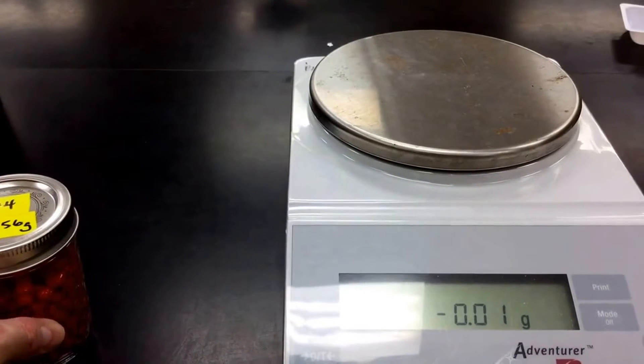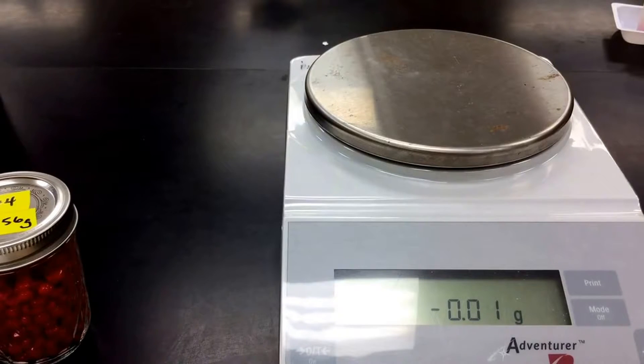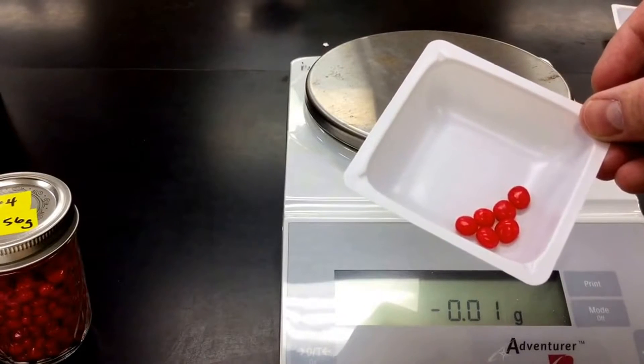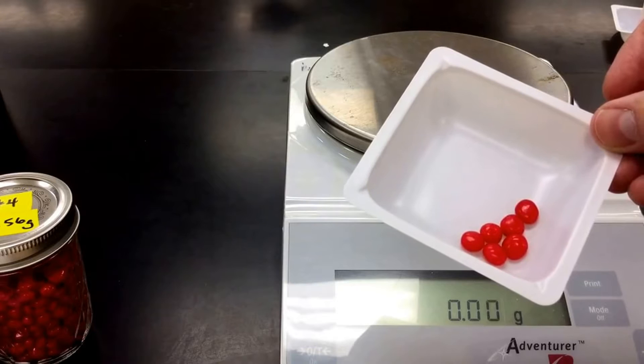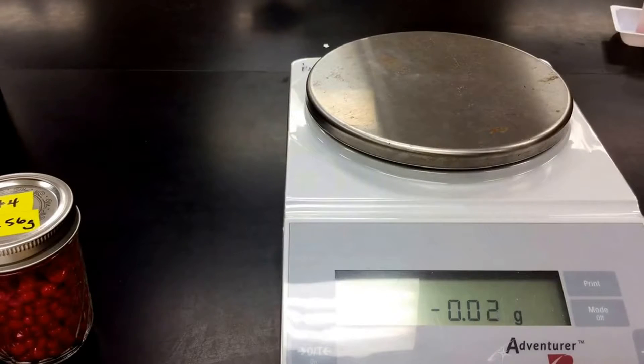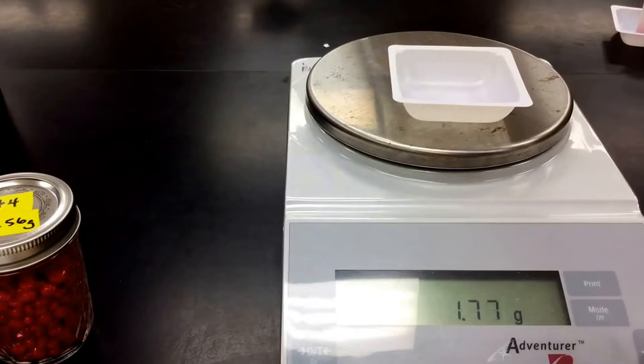Now the next thing you want to do is try to figure out and come up with a method for understanding what each of these red hots weighs. So what I'll show you is a little sampling of some red hots. What you and your partner in lab would want to try to figure out is what would be the best way to determine how many red hots there are using our balance and our sample of red hots. A couple different methods are out there. One would be to find the mass of one red hot. So I'll put my weigh boat on here and I'm going to tare my balance, and I'm going to weigh one red hot and we'll see what the balance tells us it weighs. And this could be a conversion factor that you could use.